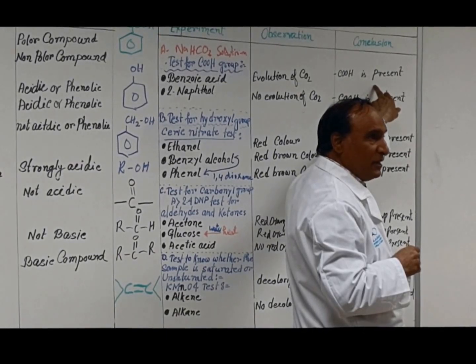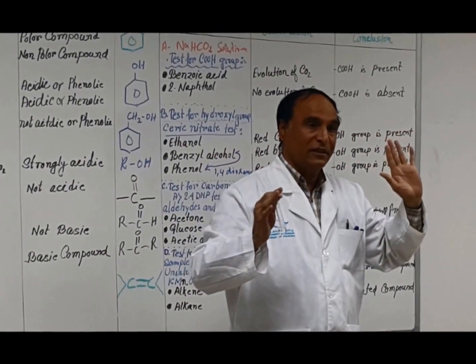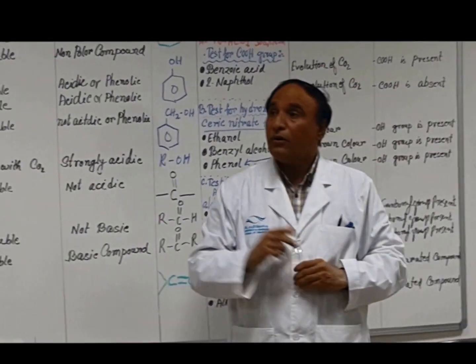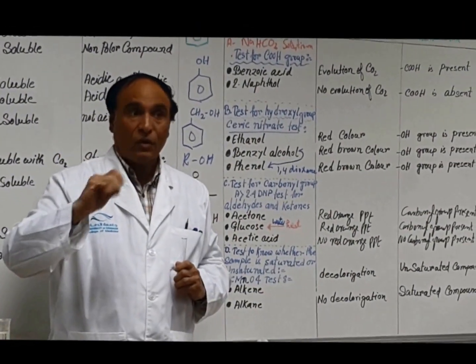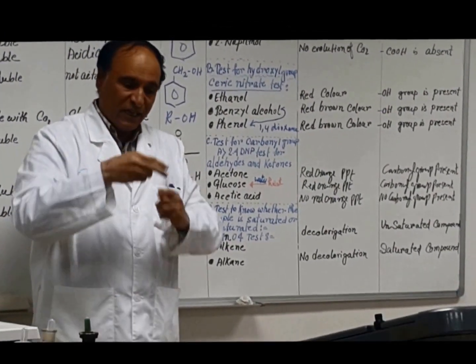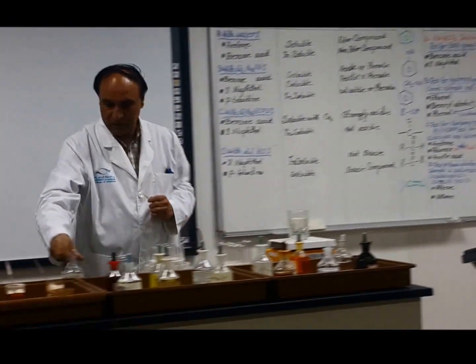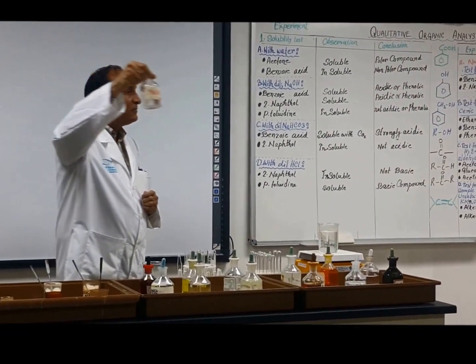Did you understand what I am saying? Otherwise, any acid will give carbon dioxide. Can you repeat? All acids, whether organic acid or inorganic acid, will give bubbles with sodium hydrogen carbonate. If you have HCl, hydrochloric acid, it will give the bubbles.